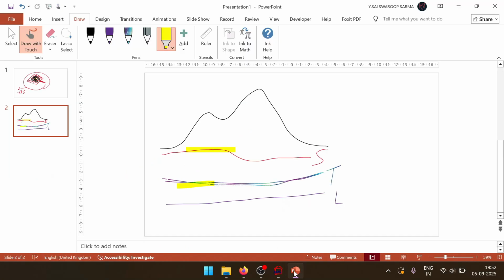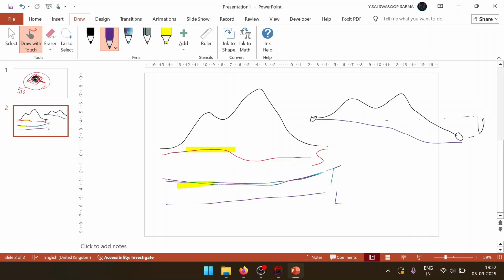Our pattern is somewhat like this. I'll show you an example. Our pattern is such that this endpoint and this endpoint are not on a straight line, like if you plot it. So you need a background which covers both of them. Shirley would be a perfect example for this, and as I said, our peak should touch this, so this should also happen. But if you take a Tougaard background, you can see it just does not touch. So depending on your endpoints, you can select which background type you want.